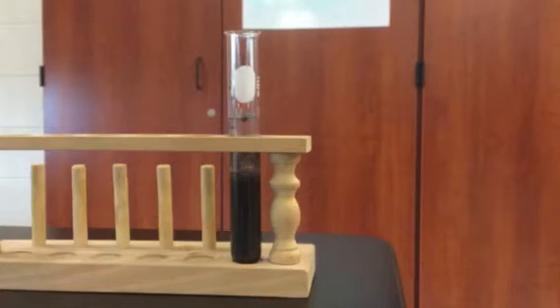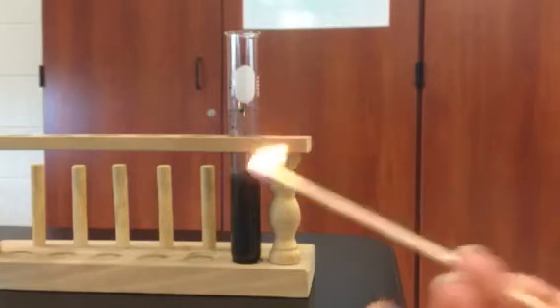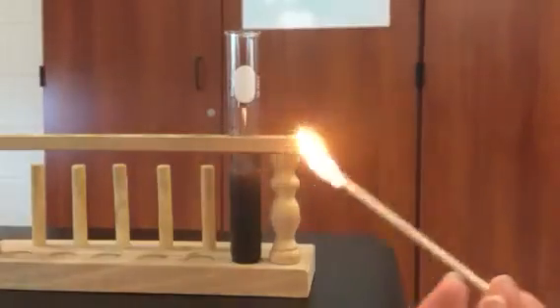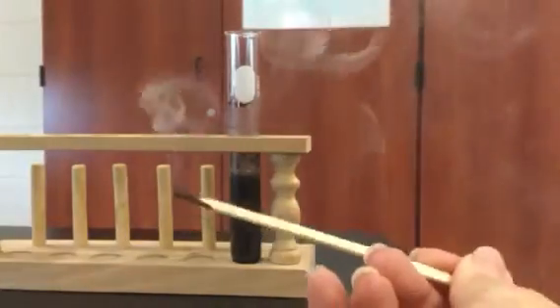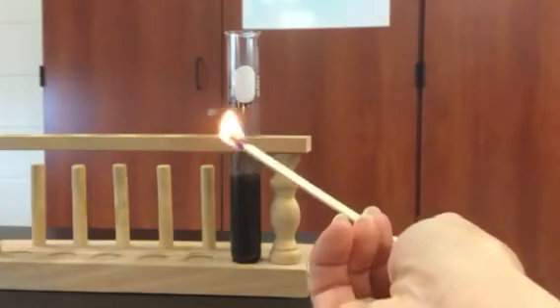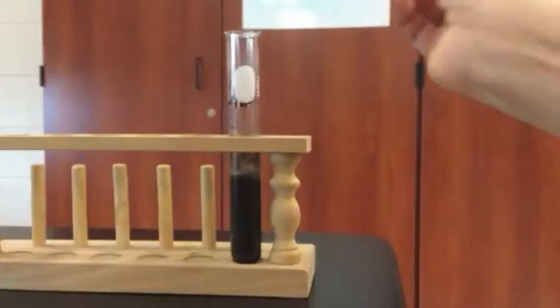I'm going to light the splint on fire like so. I'm going to let it burn for a second, but then I'm going to blow it out. Then I'm going to put it back in here. We're going to blow it out again and do it again.